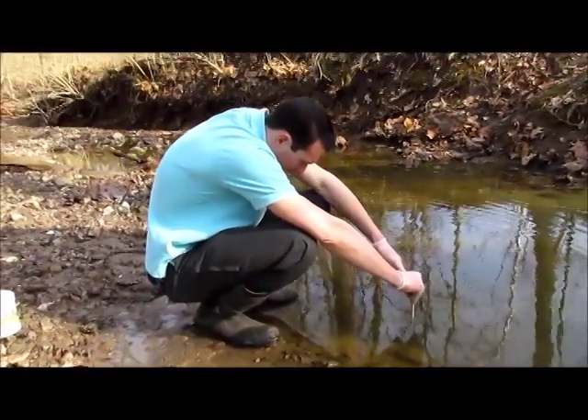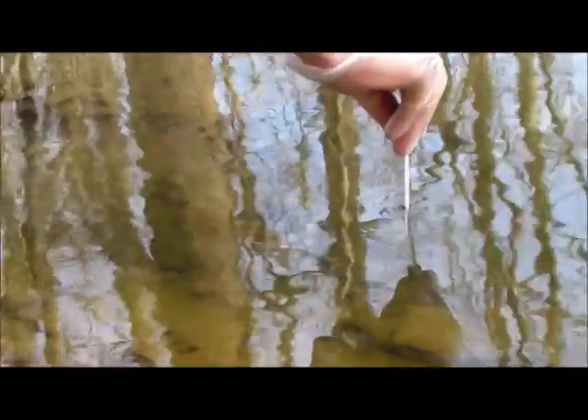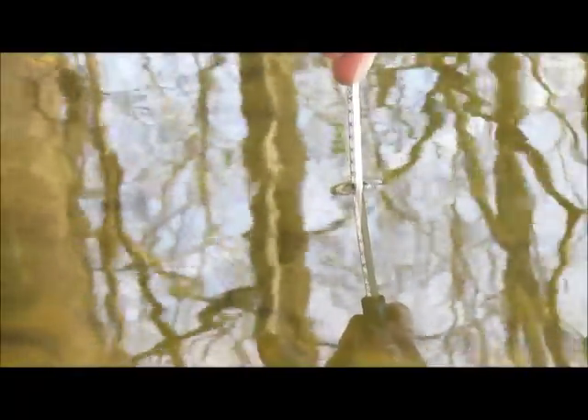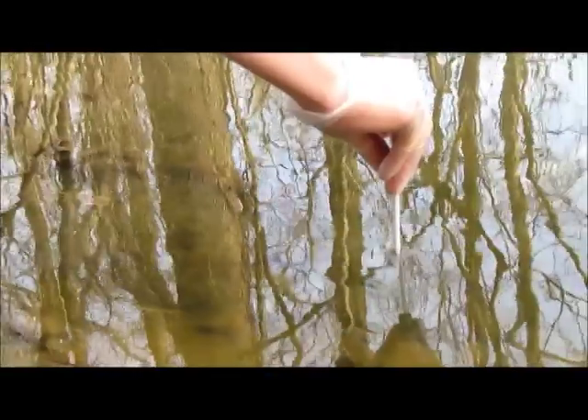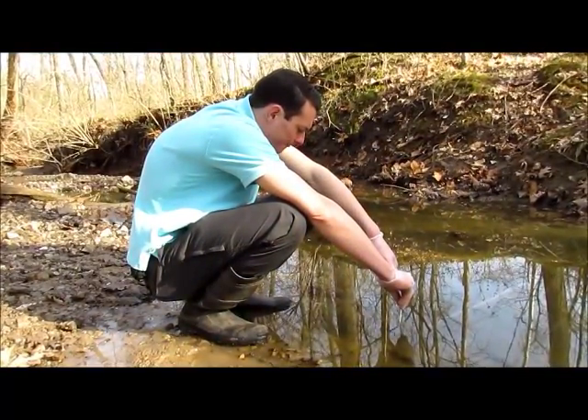You take the alcohol thermometer and hold it near the top so you're not warming the alcohol inside of it, then you hold it down into the stream. You want to dip it about four inches into the stream, make sure it's not touching the bottom. Also hold it in a shaded spot so you're not in direct sunlight if possible.